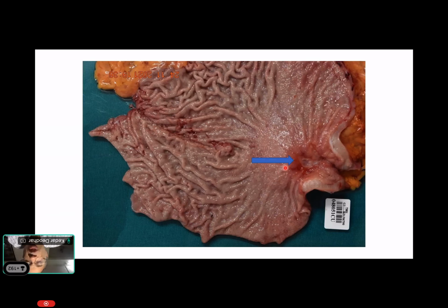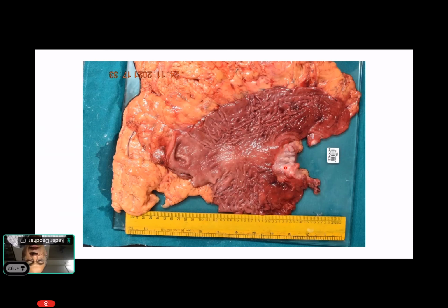which can show tumor or which can show us a complete fibrotic response post-chemotherapy. So again, this is part of the esophagus, and this is the stomach, and we see an area. I'm trying to show you pictures which are mostly post-chemotherapy because the tumor is not obvious, but this is the area, and careful gross examination tells us where we are sampling the area from.